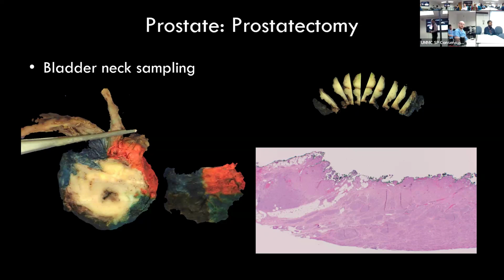If I see cancer in that area, I'm just not going to call it involvement of bladder neck. Or if I see cancer in an area which does not have the fat or these detrusor-like muscle bundles, and the margin is involved in that area, I'm not going to call it bladder neck margin is involved because the bladder neck tissue was not there.